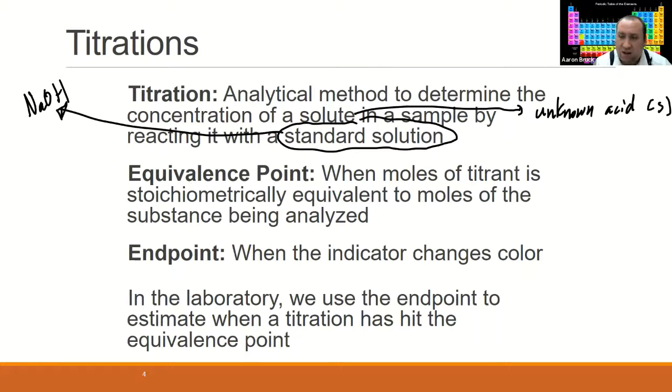And in certain types of calculations, of certain types of titrations, that is indeed what happens. But in other kinds of titrations, like the one that you're about to do, we don't actually neutralize the acid and base solutions. The resulting solution ends up having a basic pH because of the weak acid character of the substance that we are using.